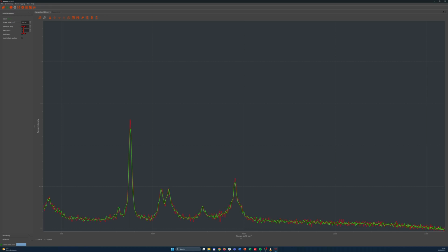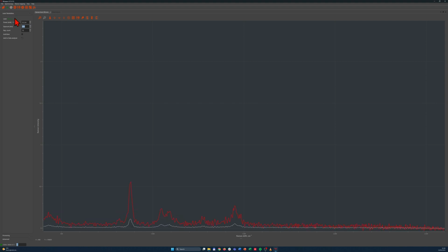Maybe we can actually change the repetition count. Let's, for example, do 10 repetitions. And we can also change the exposure time. I don't know, we can do 200. And as you can see, because the exposure time changed, then the signal level also changed. And let's capture the data.